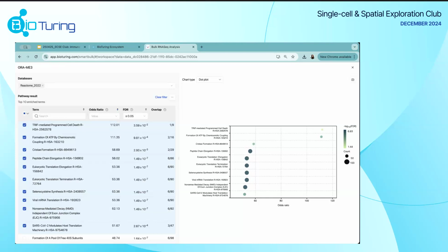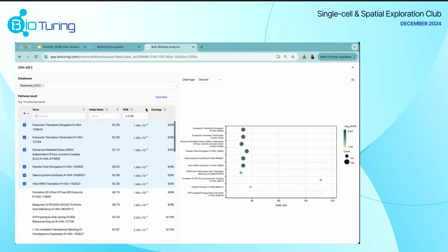And we can also see that ME3, since we did select this specific module, captures a different post-transcriptional regulation and cell death control. So these are the different pathways that we're able to really gather. And you can also change the FDR score to see these clear pathways a bit deeper, focusing on very specific significant pathways within this network module.